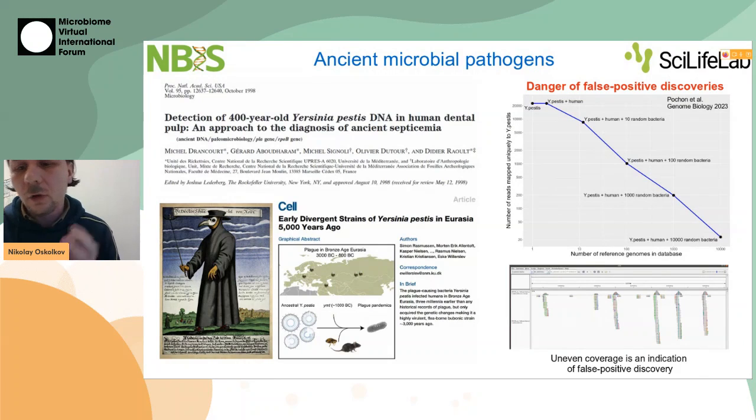So in fact, if you had looked inside the alignments, you would have realized that the reads map in this so-called non-uniform or uneven coverage way. So typically what people say in this case is that these reads actually originate from microbes other than Yersinia pestis, but they map to conserved regions of Yersinia pestis, although they are from other microbes.